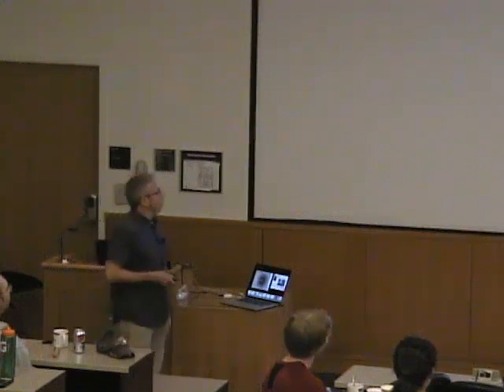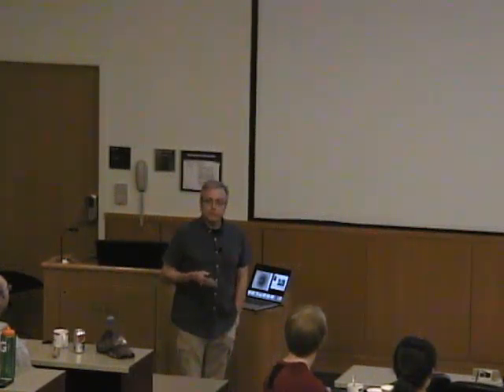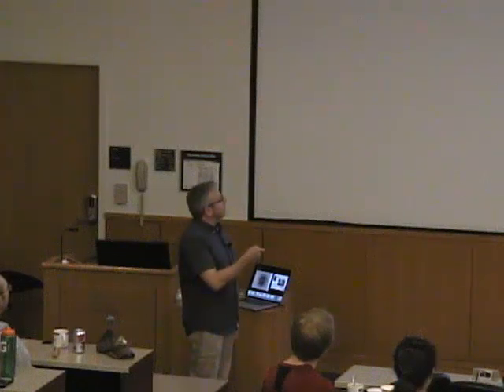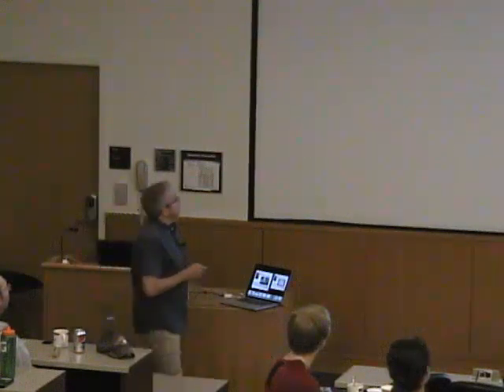Okay, so everything started something like 100 and odd years ago with obviously the invention of X-rays. You need to have X-rays before you're even able to interrogate molecules on that level, and they were invented by this gentleman here, I guess with a hairdo that's fashionable again nowadays. This is Wilhelm Conrad Röntgen. He was working in Würzburg in Germany. This is his lab. Actually, it pretty much looks like most labs today.